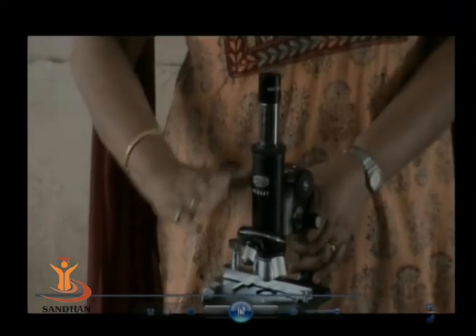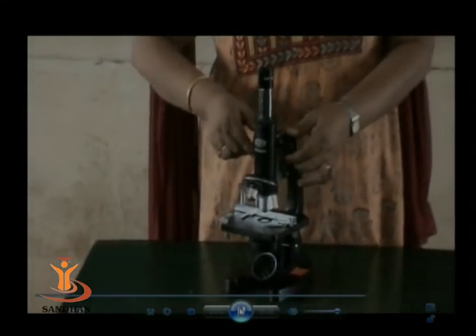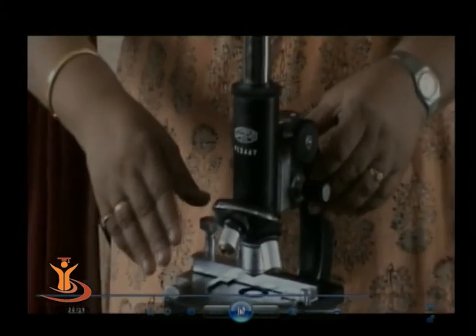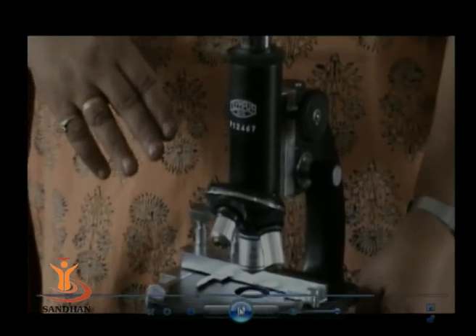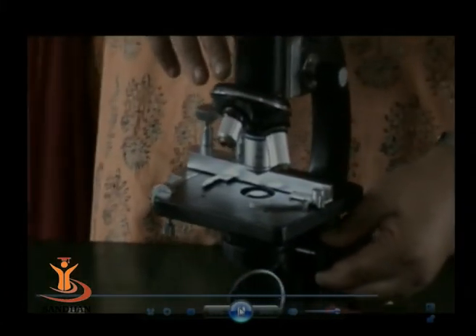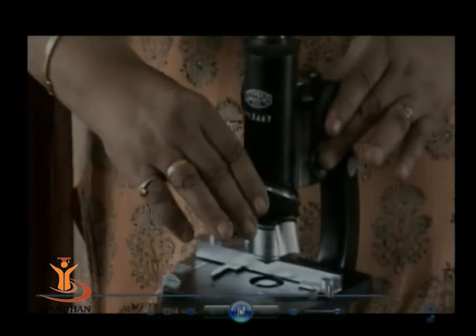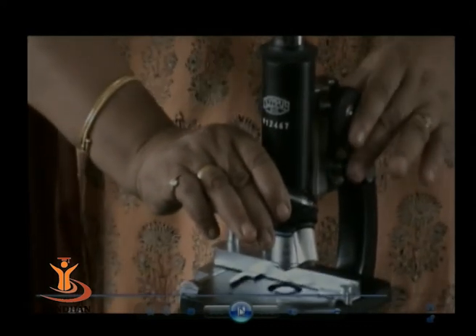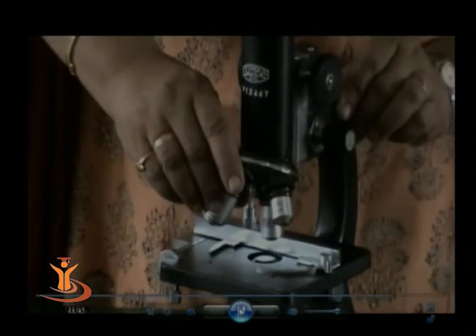After considering the light path, now let us see how the focusing is actually done. You have to first see that all the light adjustments are proper. When you are using a stained preparation of any bacteria, for example, you should use the plain mirror. You should keep the condenser up. The diaphragm should be completely open. First, adjust the light using the low power objective. Then you turn it to the high power. Then you turn it to the oil immersion objective. See that it remains dipped in the drop of oil.